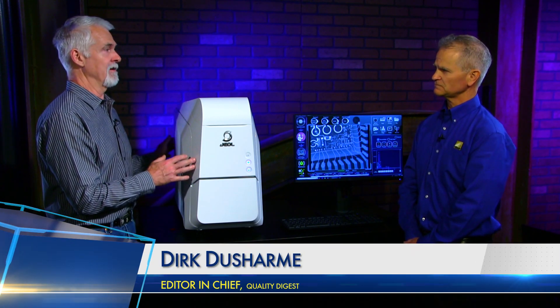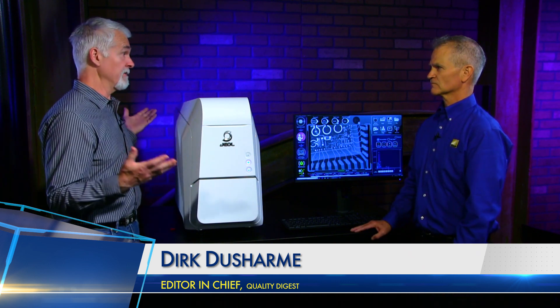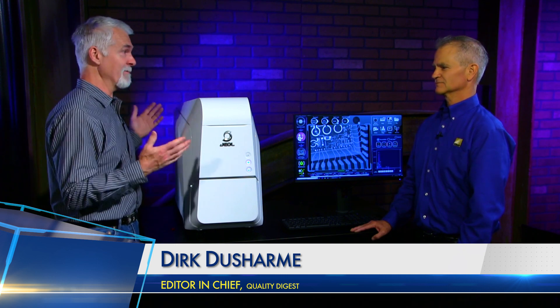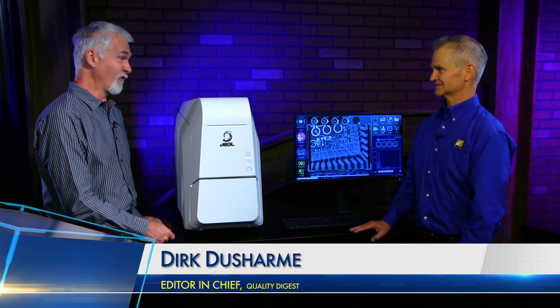It wasn't all that long ago when an SEM of this caliber was really huge — maybe not the size of a refrigerator, but pretty darn close. It took a forklift to lift it. Well, this almost took a forklift to lift it.